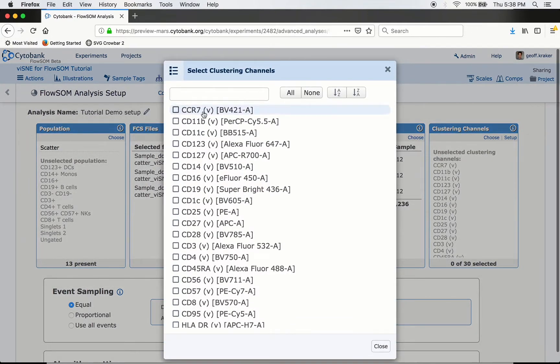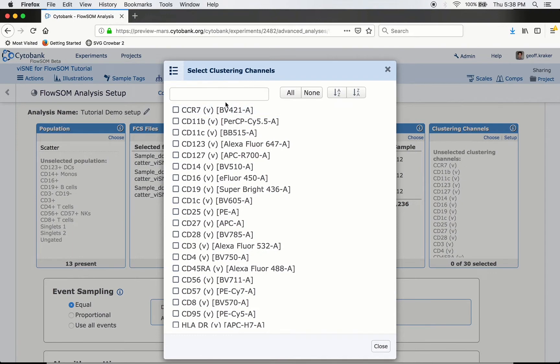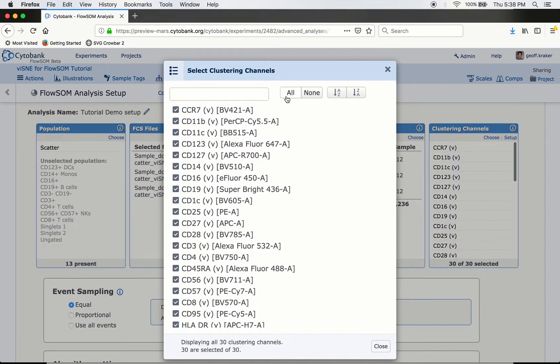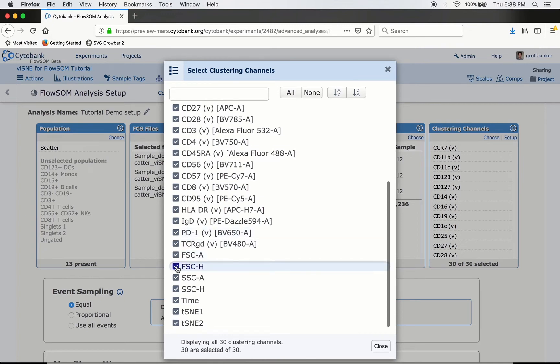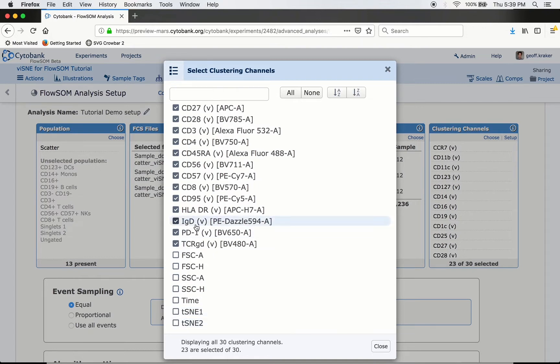Next, choose which clustering channels to use. The channels with a 'V' next to them are the ones used in my VISNEE calculation — I'll use those same channels for FlowSOM. I will not use scatter channels, the time channel, or the tSNE channels. Surface markers are great to use; functional markers are also okay but keep in mind how they'll affect the result — if a functional marker goes up or down, it changes where the event sits on the tree.